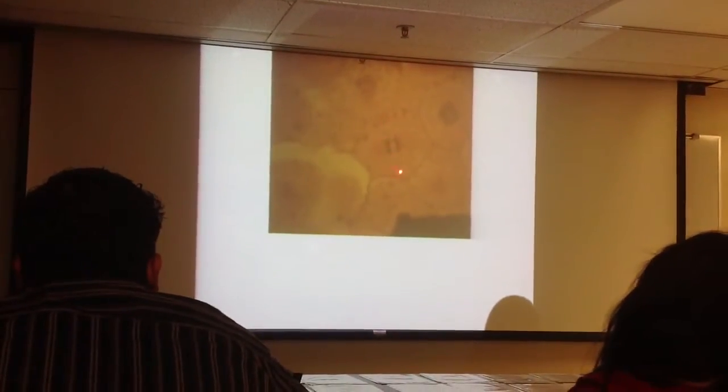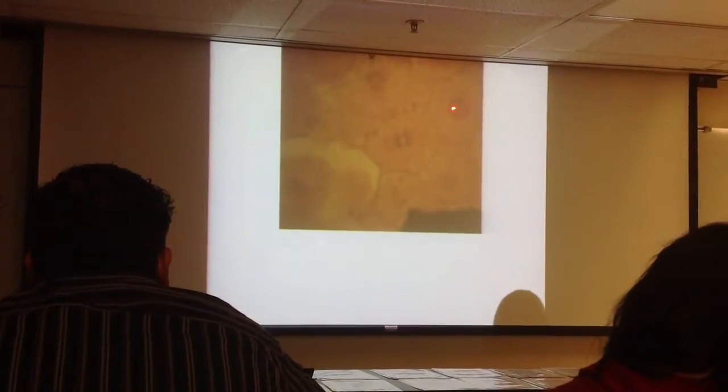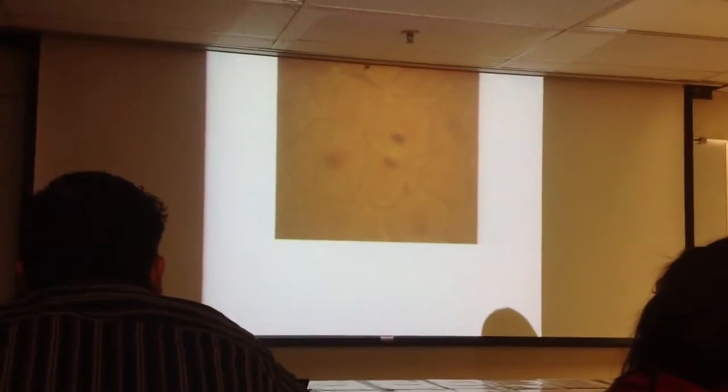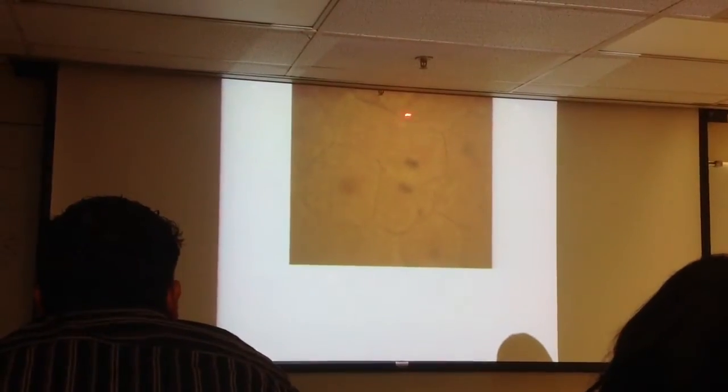Which phase of the cell cycle is that one in? Anaphase, they're moving apart. What's that? Prophase. What's this stuff called? Cytoplasm. Those are examples. What phase is this one in? Telophase.